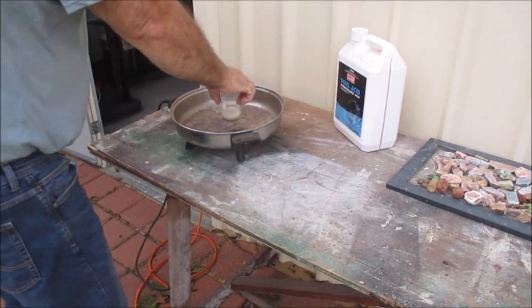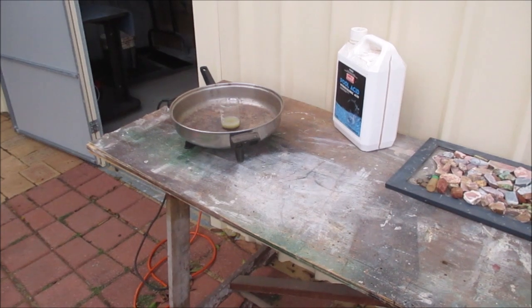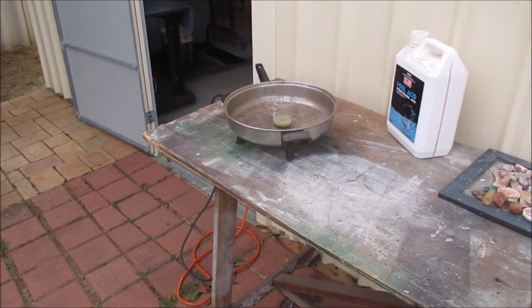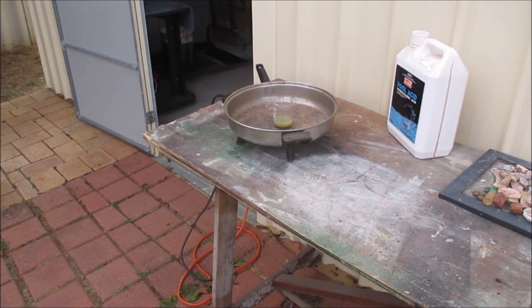There it is. I'm going to put it on the heat and that should start to react — the acid once it heats up will start to react. Anyway, I'll get back to you when I've progressed a bit further.